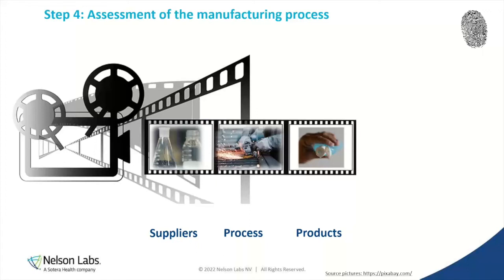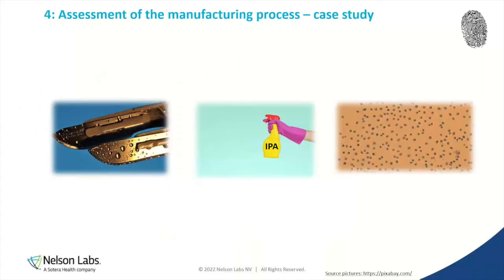So, okay, we also want to think about products used within the process. Maybe there was a product change, which wouldn't be marked as a change because you're still doing the same step, and somebody's saying, well, it doesn't matter, maybe we're making that better. We have an example where somebody said, we need to clean these up a little bit because we need to address some bioburden issues. So we're going to add an IPA rinse, an isopropyl alcohol rinse, to the product.